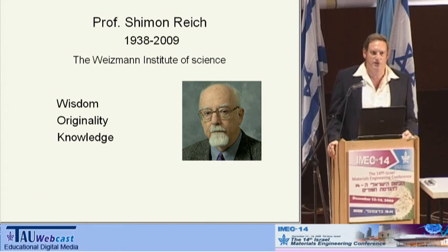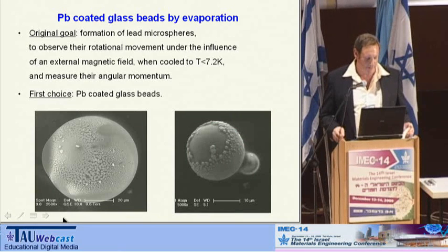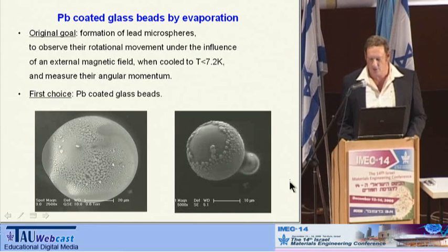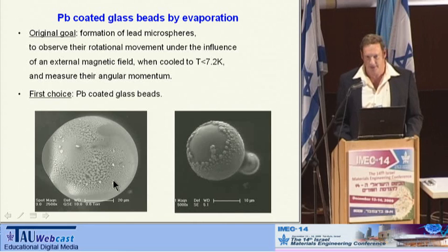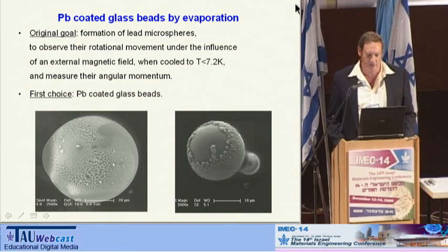The first choice was to use commercial glass beads that would be coated by evaporated lead. As you can see from these micrographs, this idea was not very successful because of imperfect coating or shadowing effects. Therefore, we tried another route.